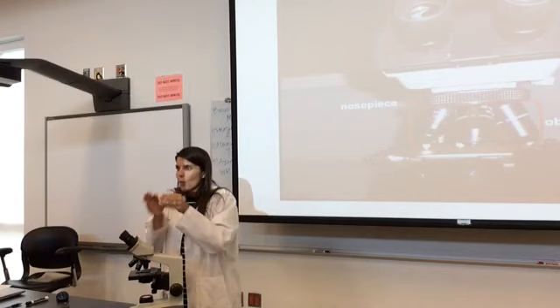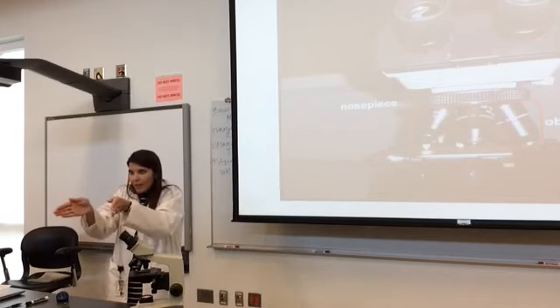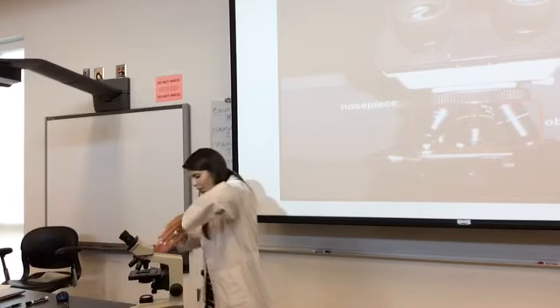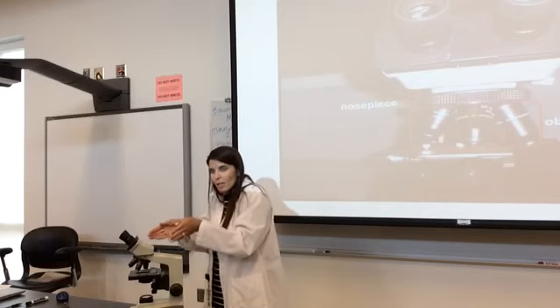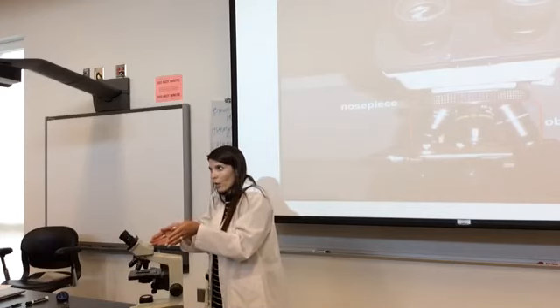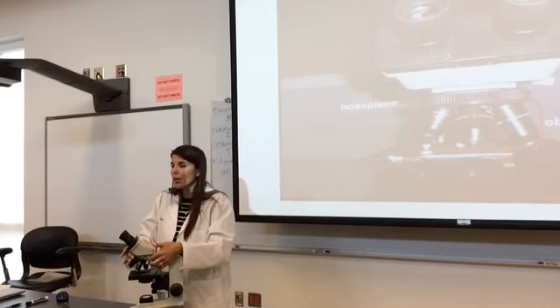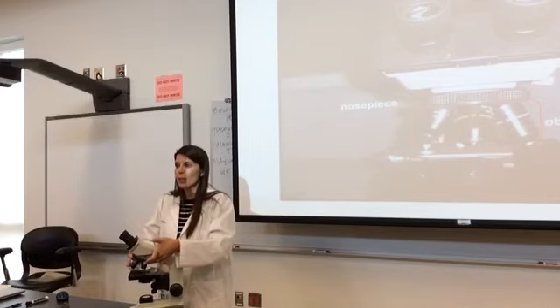Whenever there's that much room, that means within that gap, I can see this, like this much. Okay, so it's kind of shooting down. My working distance is small, so I can see this small field. We call it a field of view. Go from low, please, and thank you, without moving your stage, just revolve your nose piece to medium, to 10.